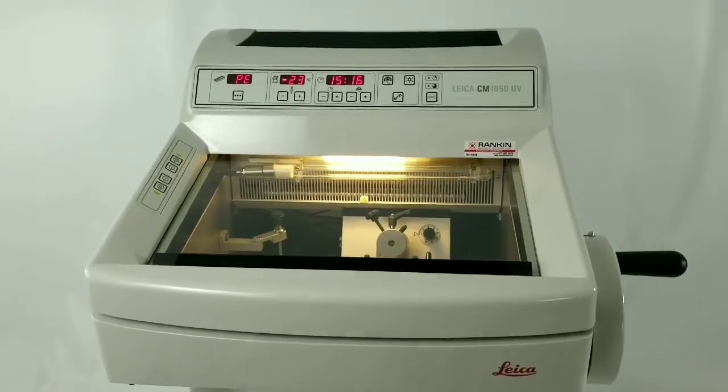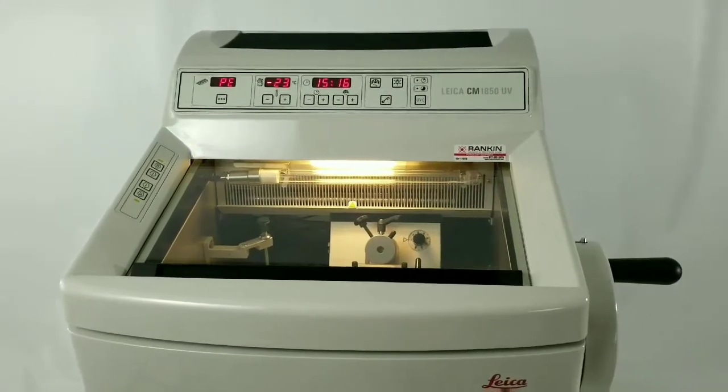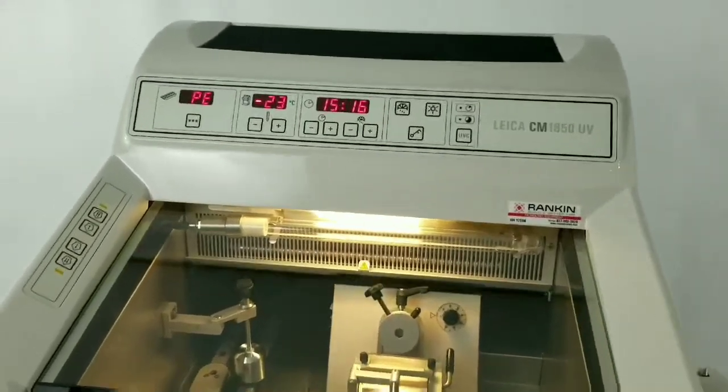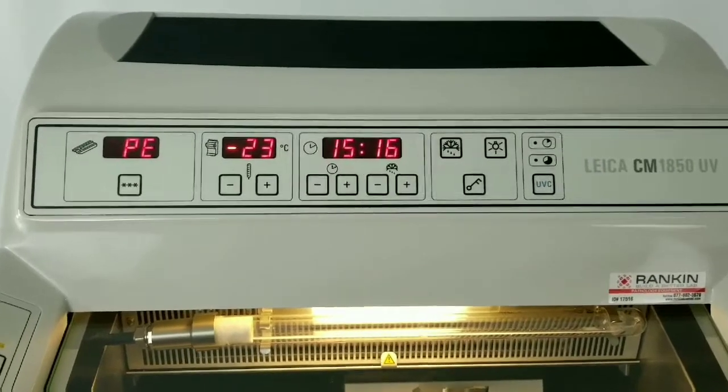I'm going to walk you through a brief description of the Leica CM1850 UV Cryostat, the display and the buttons, and also how to set your values.